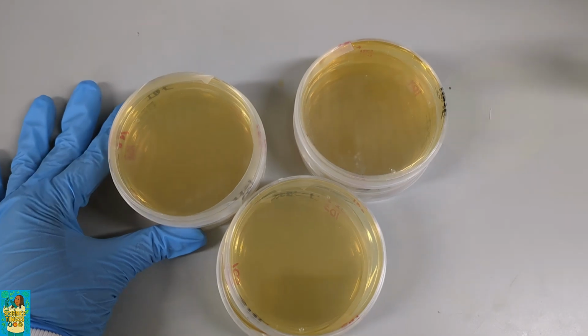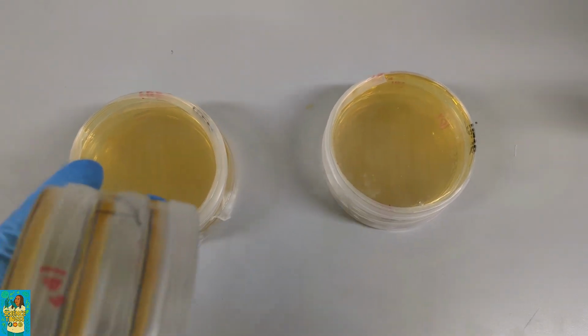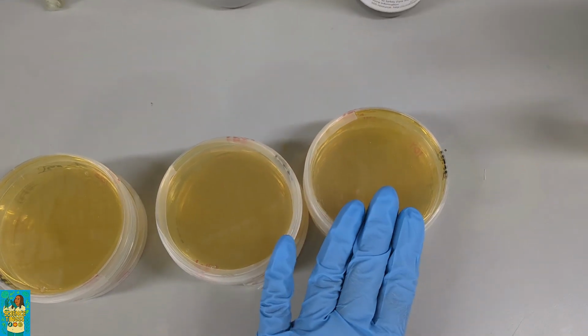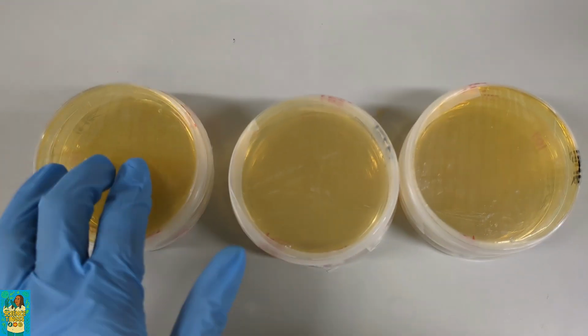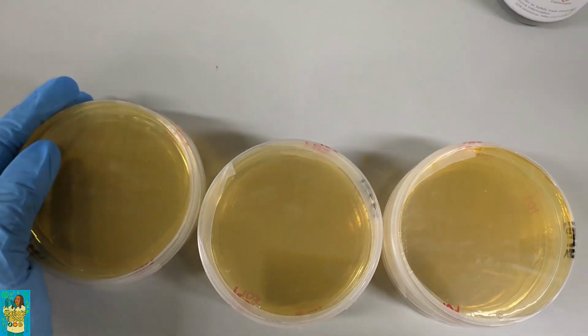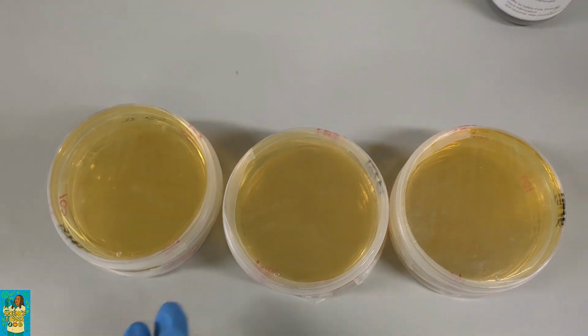These are the plates with the 3 dilutions that I used, the 10 to the 3, the 10 to the 4, and the 10 to the 5. And as you can see, the plates are devoid of cells, but we'll come back and see in a few days if there's growth, and especially the growth that we want.